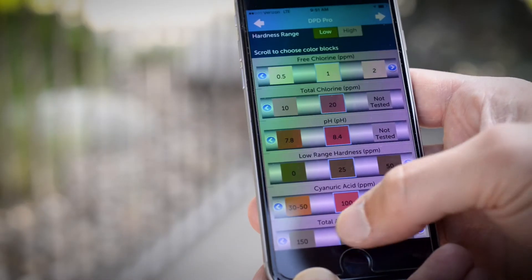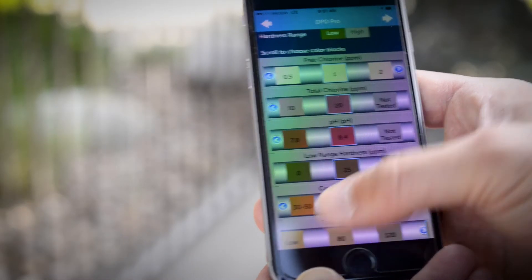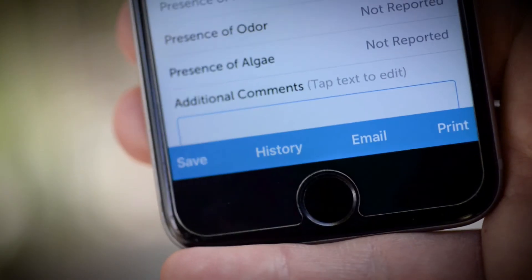Enter the test results obtained by selecting the corresponding color block or by manually inputting a number. A test report will be generated that you can save, email, or print. You can also export saved test results into Excel to track pools or spas that require extra attention.